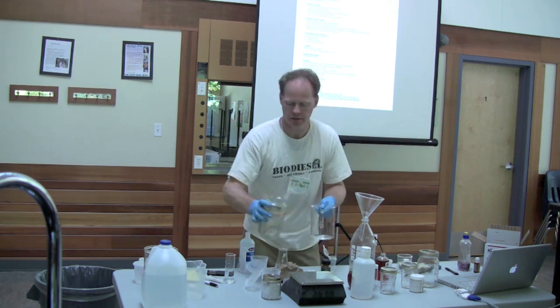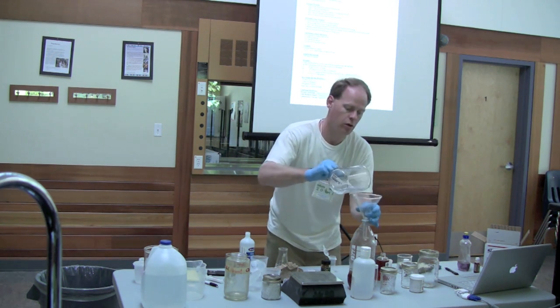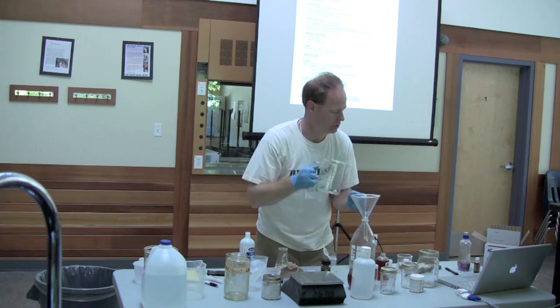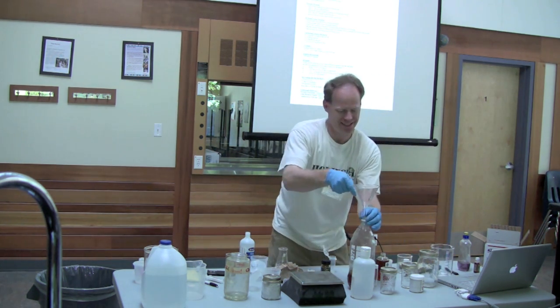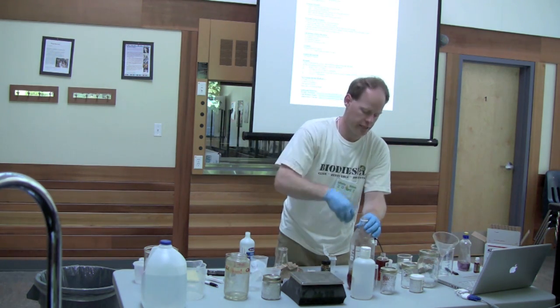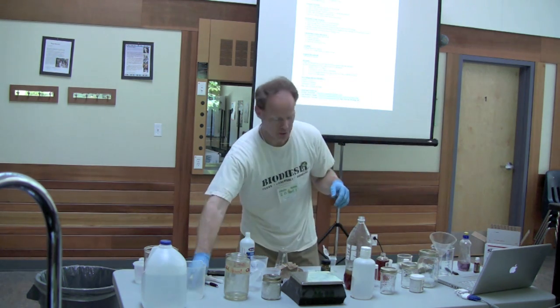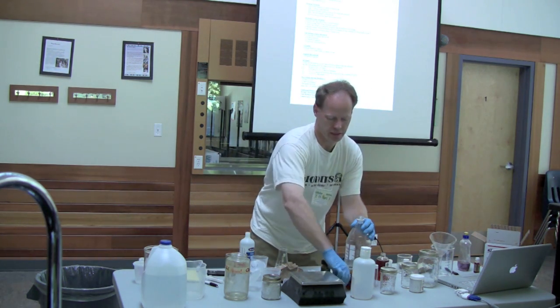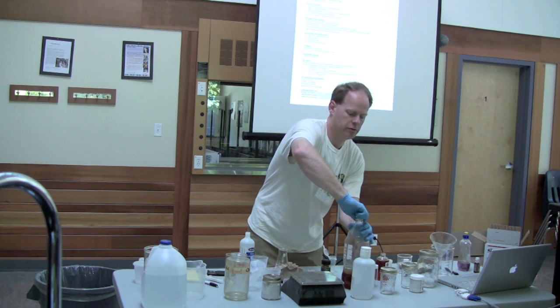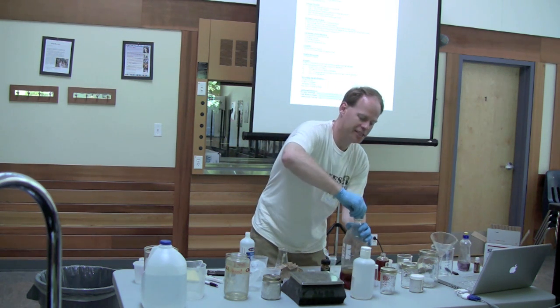I got a little bit later of a start than we would like, but okay. That should be good enough for demonstration. For this demonstration, my goal is to make some slightly underreactive fuel. Later on tomorrow, we will test it and see how well we made it. But for this, if I can get this lid on. That is a tricky little lid.